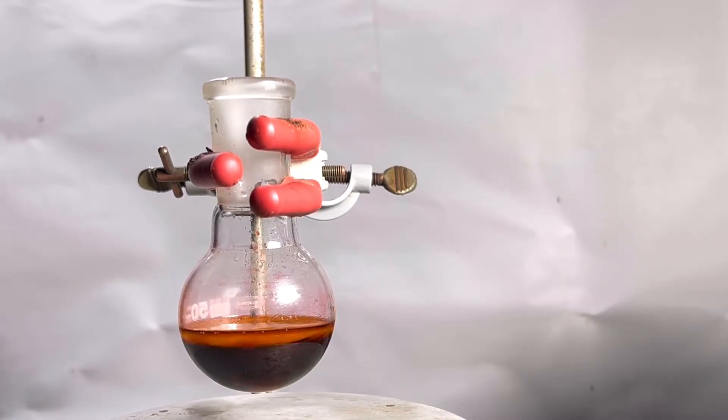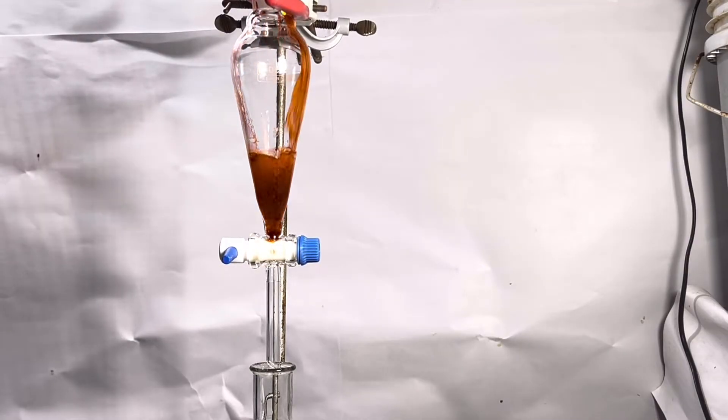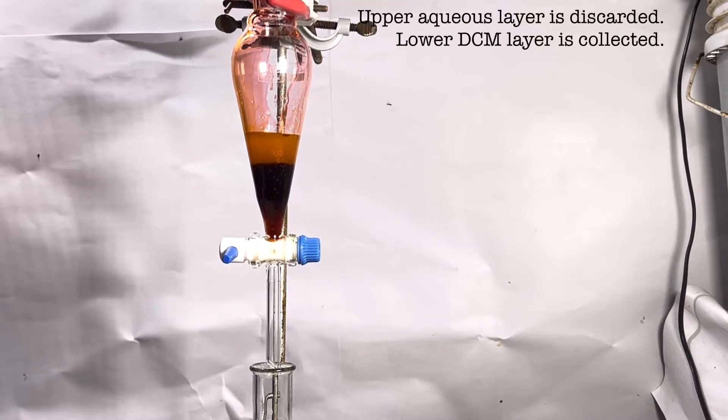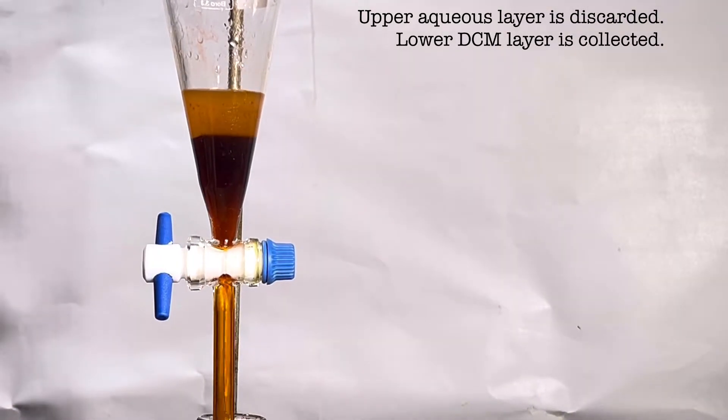After stirring for few minutes the contents of the round bottom flask was poured into a separatory funnel. You can clearly see the two layers. The upper layer is the aqueous part and it was discarded. The lower layer contains our desired product phenolphthalein. It was drained into a beaker.